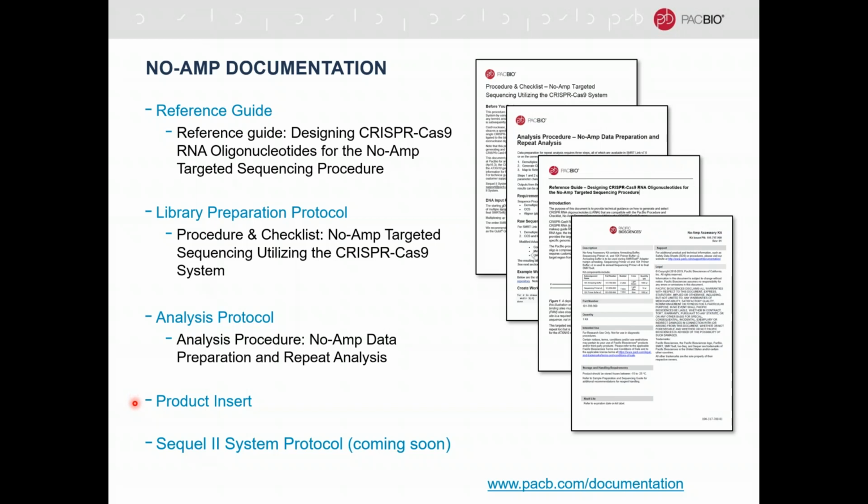Standard for every product release is a product insert, and those of you who are interested in porting this protocol over to Sequel 2, we're in the process of launching a Sequel 2 protocol in the upcoming very short time period.